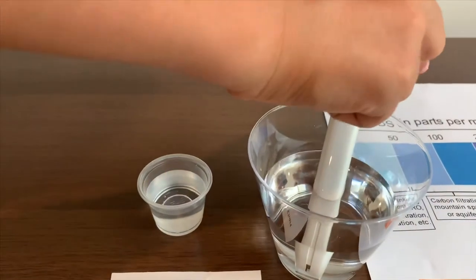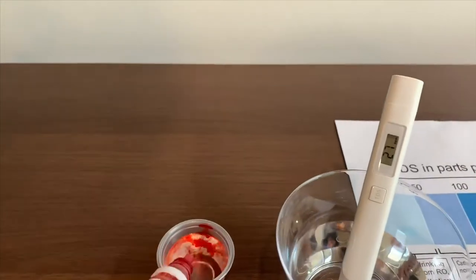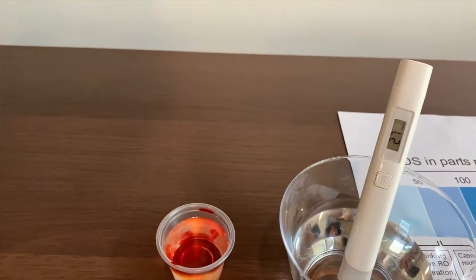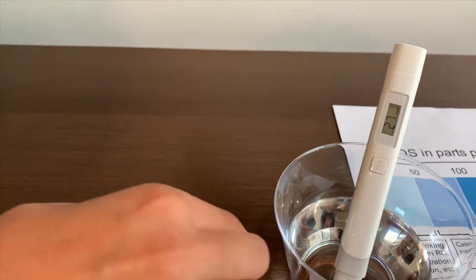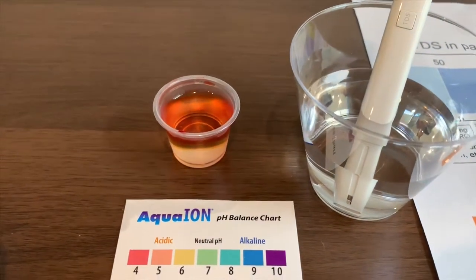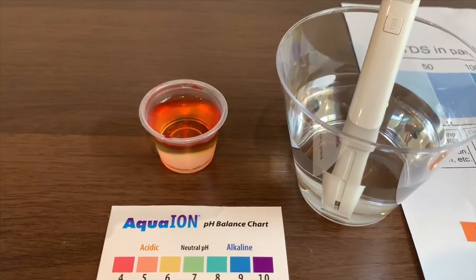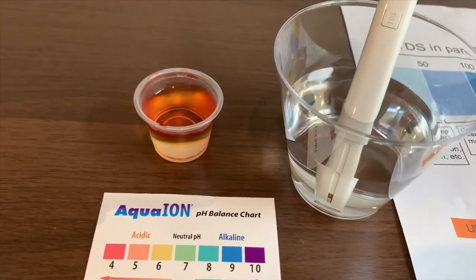Now let's test the pH level. Two drops. It is a 4.5. That is acidic.